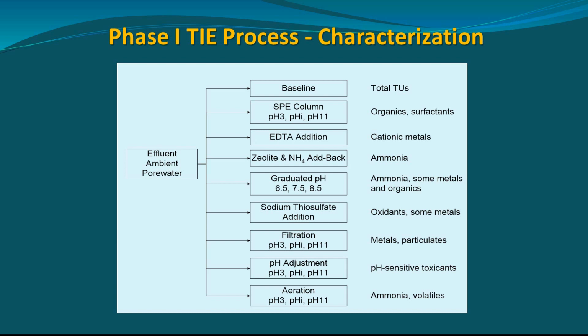The pHs are more for the industrial chemicals and volatile chemicals, like things that if you could lower a sample down to pH 3 and it'll blow off the contaminant, and you raise it back to ambient for testing and that contaminant's been removed. It's more for industrial processes. It also plays a role with ammonia. Okay, characterization. Is it a metal? Is it ammonia? Is it an organic?